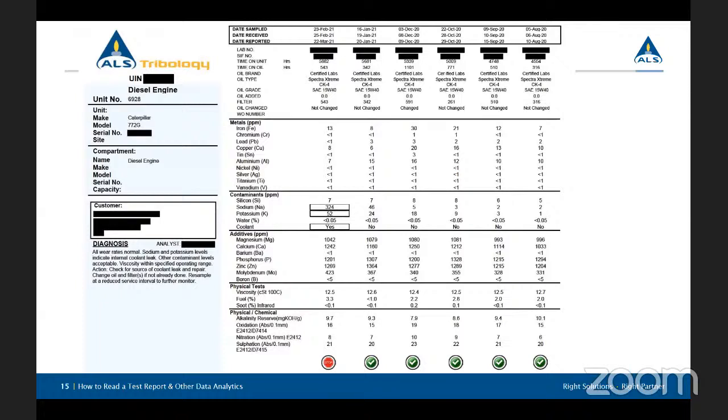Now, you have to be careful because sodium can be found in gasoline engine oils. So when using sodium by itself, you've got to be a little bit careful. You've got to really look at the application and what oil is being used before you jump on it's got to be coolant if it's sodium.